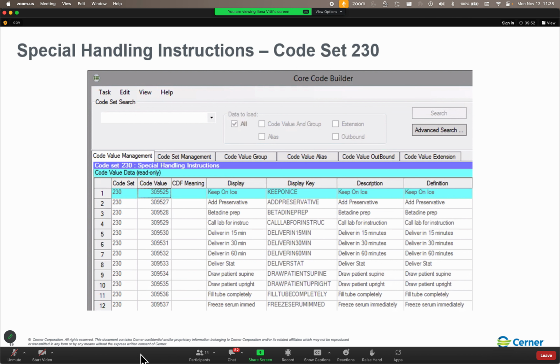All right. Now, let's talk about collection classes. Now, folks, I'm going to tell you right now, I want you to think of collection classes like an octopus. The collection classes have their arms all throughout the specimen management workflow. So you're going to be going, wait, why is that doing that? Oh, it's the collection class. Hey, wait a minute, why is this? Oh, it's the collection class.